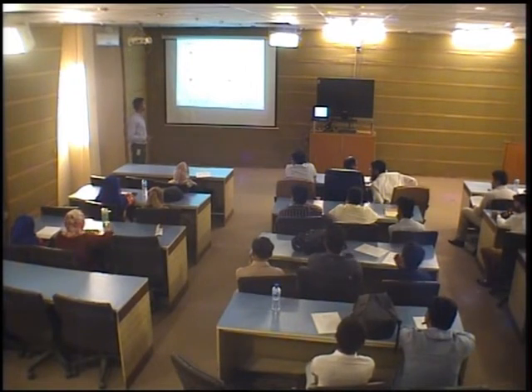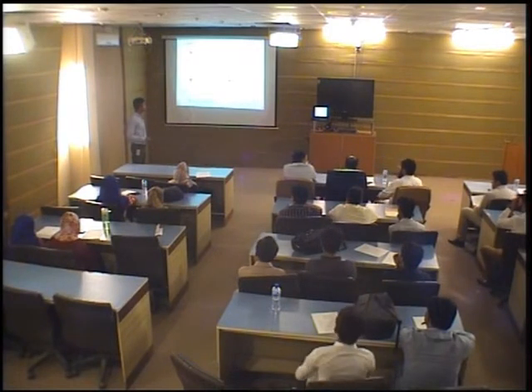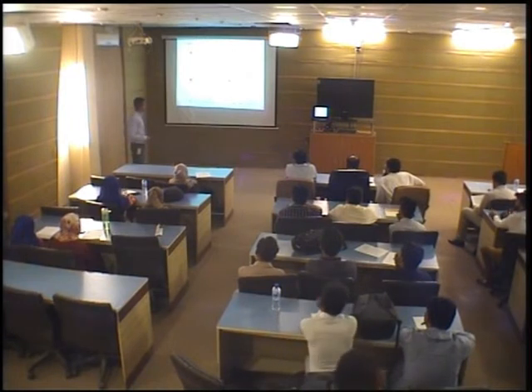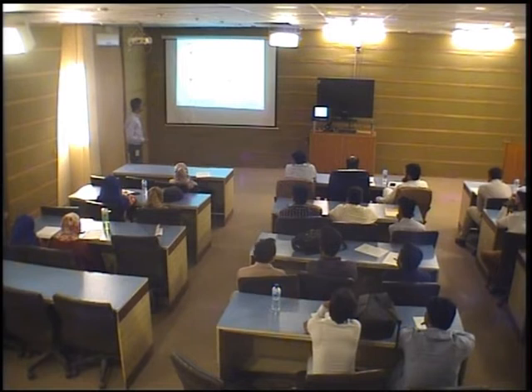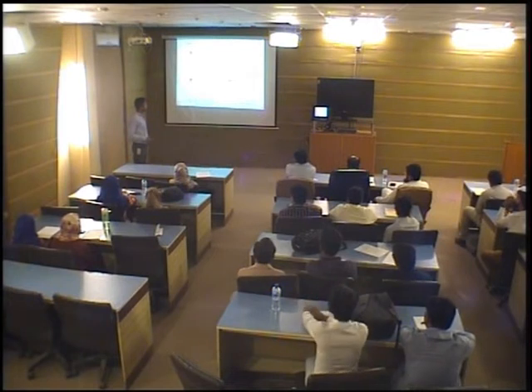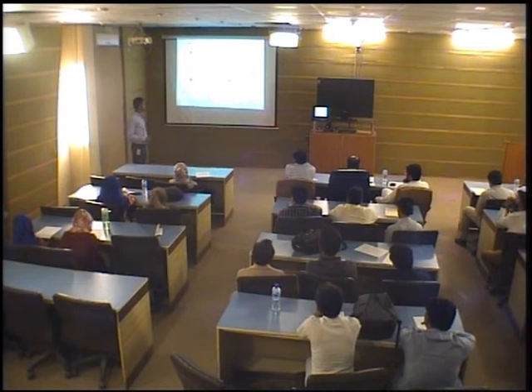While figure F ranges from 468 to 504. We have observed 3 zinc lines and 1 lead line. In figure G, it ranges from 520 to 561. We have observed almost 3 lead lines, 1 iron line, 1 barium and 1 mercury line. While figure H ranges from 580 to 670. We have observed sodium lines, hydrogen and lead lines here.